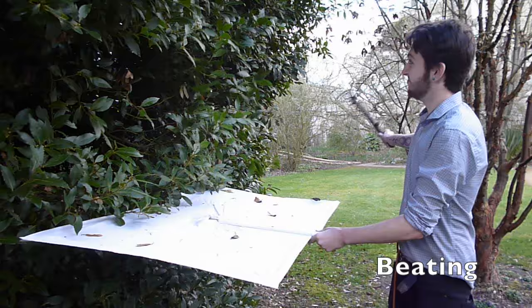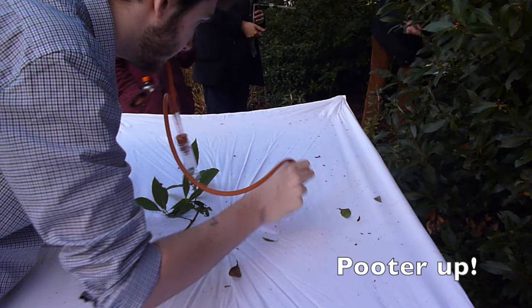Position your beat tray under some vegetation and start swinging. Proceed to check your tray for specimens and suck them up using a pooter. These may include flies, beetles, bugs, psocids, and lacewings. And remember, don't choke.